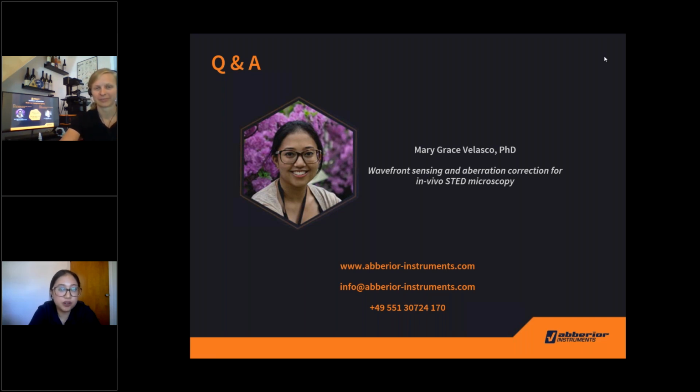Yes, of course. However, for most STED experiments, we always advise to use organic dyes over fluorescent proteins whenever possible, simply because they're just brighter and more photostable. So in general, we always say that STED microscopy has the same dye requirements as confocal, and as with confocal, you always want to use bright and photostable dyes. The difference is that with STED microscopy, this brightness and photostability requirement is just a little stricter, and so you'll always want to use very bright and very photostable dyes for STED whenever you can.